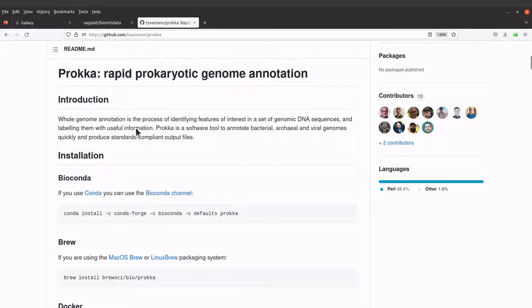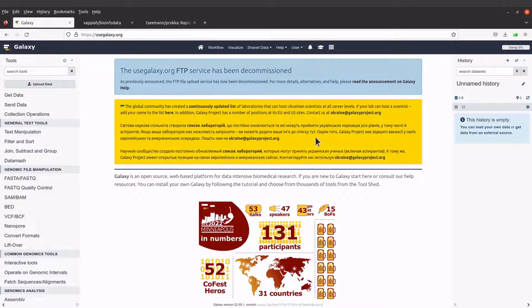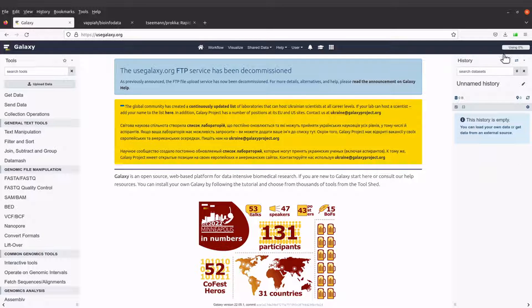After you have logged in, we need to first create a history. We want to track this activity and make sure that whatever we are doing now is saved in a particular history, so that it becomes easy to locate, download the files, and even upload files to that particular history.